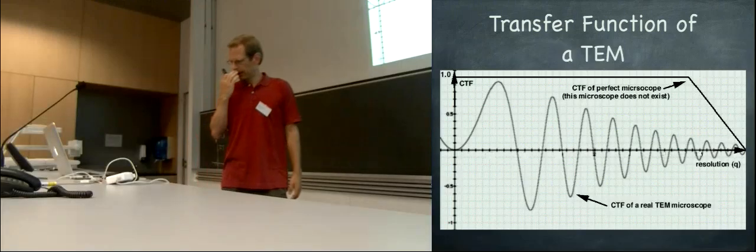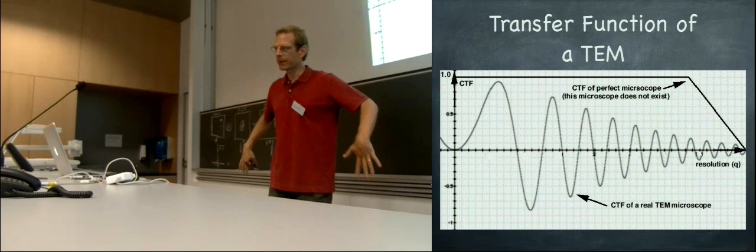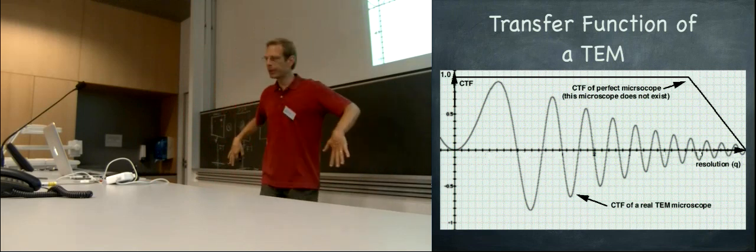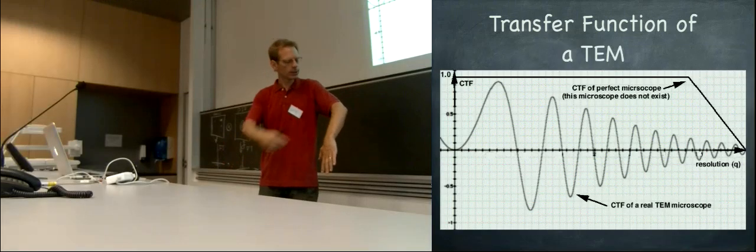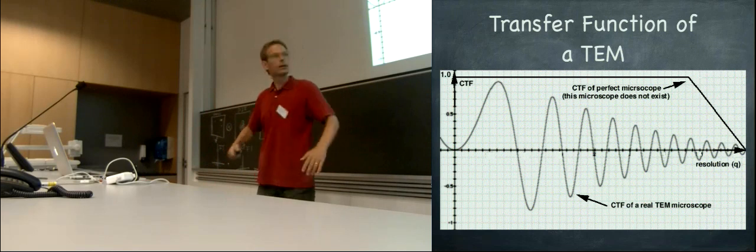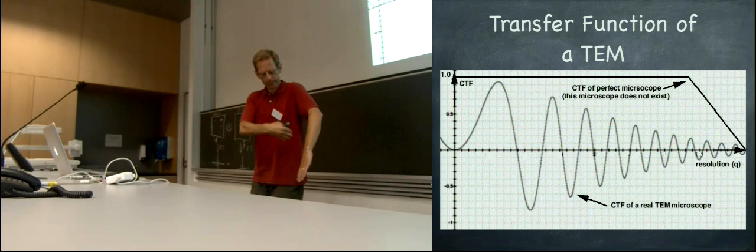And then, if I would be now this atom structure, and I would sit there, and one would take a picture of me with an electron microscope like this, then the picture would have a low resolution component, which is nothing arm, nothing belly, nothing arm. Yeah? And then this might be this frequency here, which is nothing arm, nothing belly, nothing.